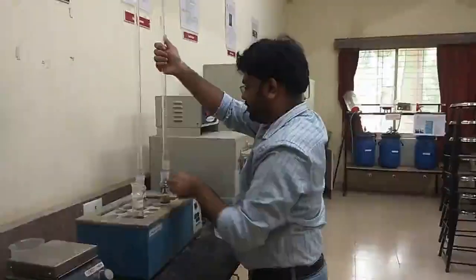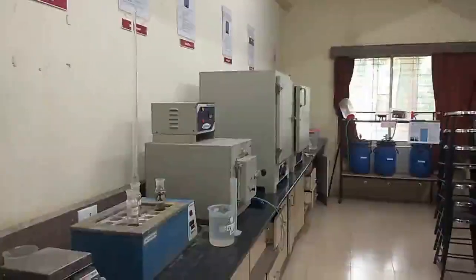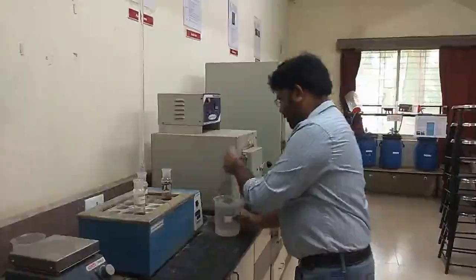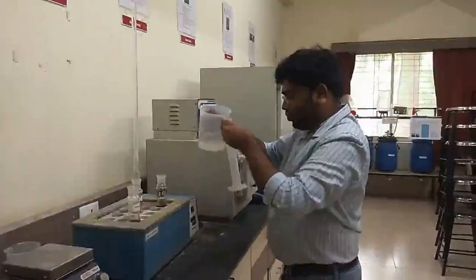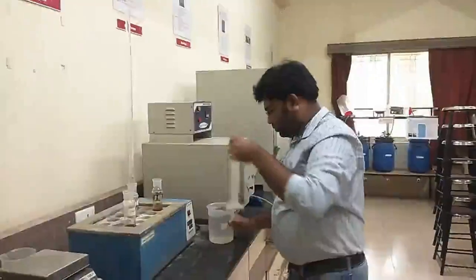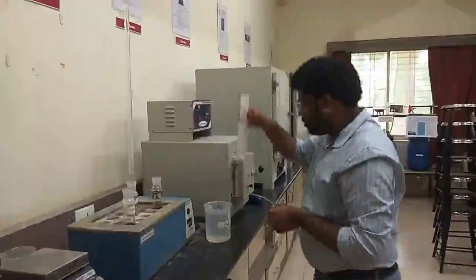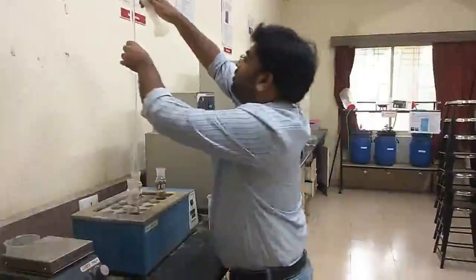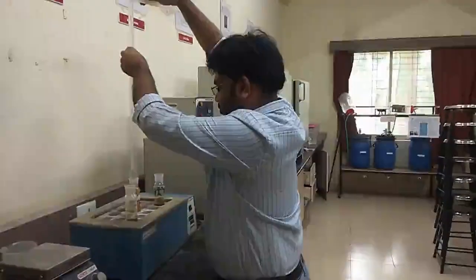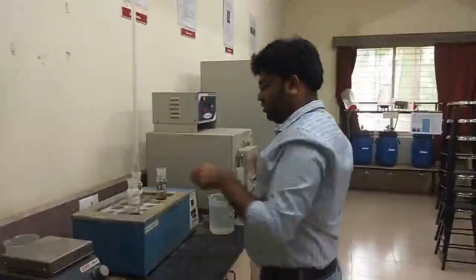Removal of the reflux condenser. Last 20 ml. A bit slow addition is required.